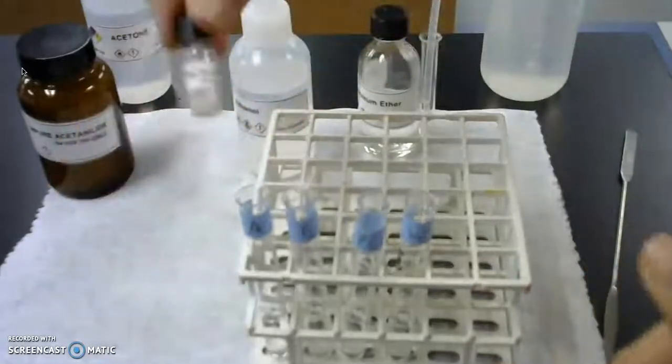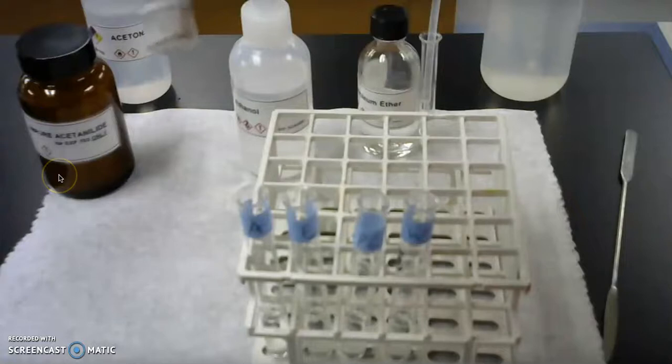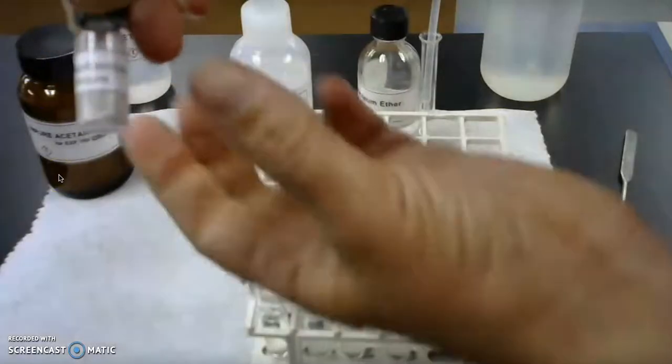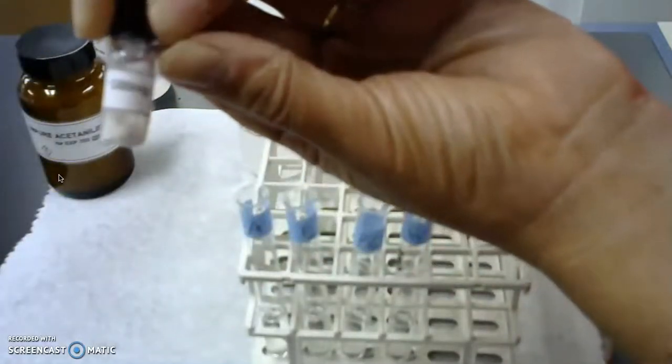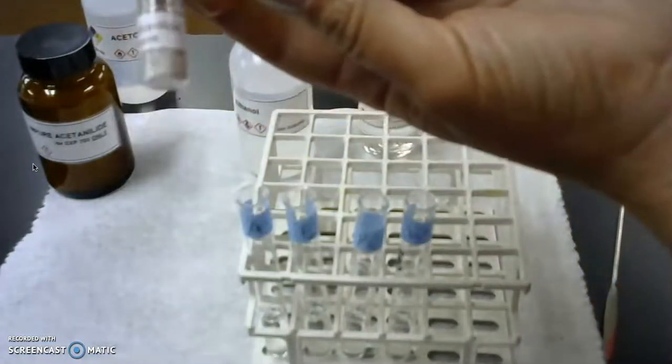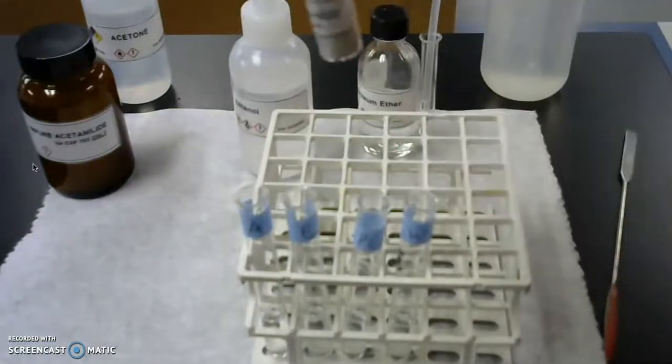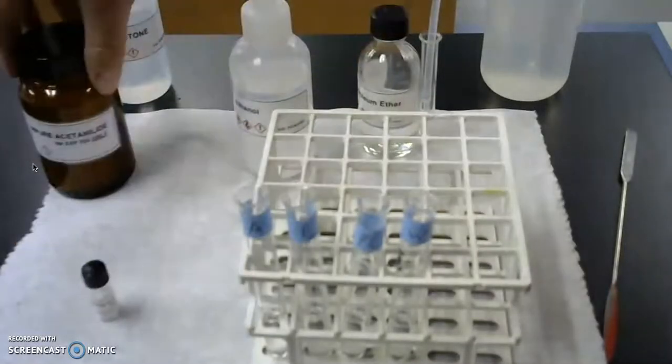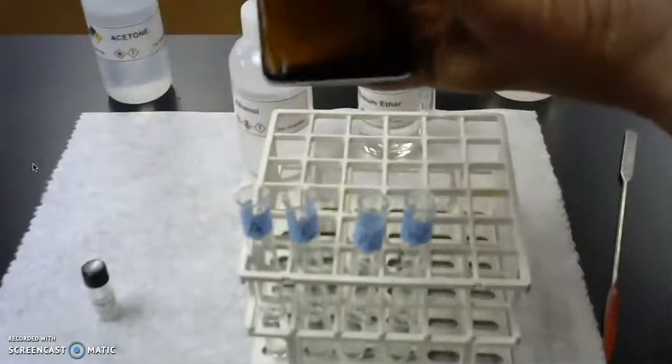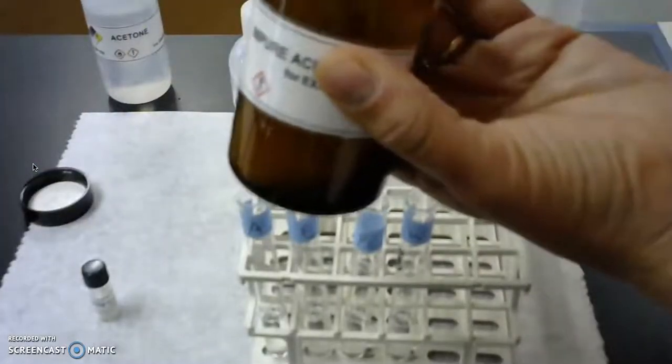Now I need to measure out my acetanilide, and I'm going to add about a hundred milligrams of acetanilide to each of the tubes. Again, it doesn't have to be exact—it's an approximation when we're trying to determine recrystallization solvents. And the amount that I'm going to use of acetanilide is about enough to cover the end of my spatula.